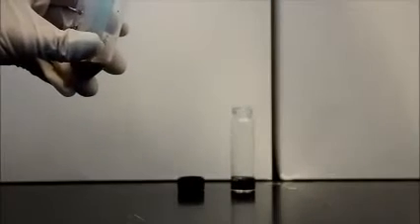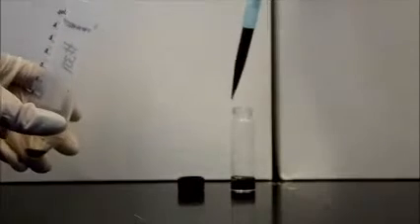Finally, we transfer 2 milliliters of the iron oxide sample to the vial to be observed under the UV lamp. For this portion of the experiment, extra eye protection is necessary. When placed under the UV lamp, the iron oxide sample goes from dark brown to bright green.